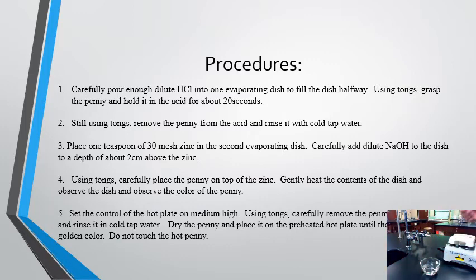So you're going to do that, but put the whole entire penny into the solution, let it go ahead and clear off the surface, and then once you do that, you can pull the penny out using your tongs and just rinse it off. So you don't want to stick your fingers into the hydrochloric acid. That will cause some chemical burns. So that would not be pleasant.